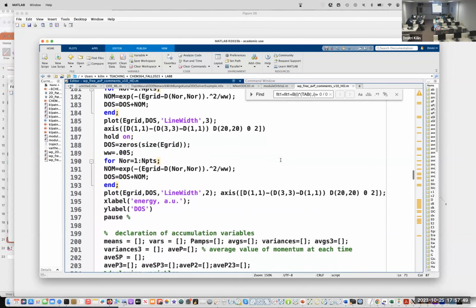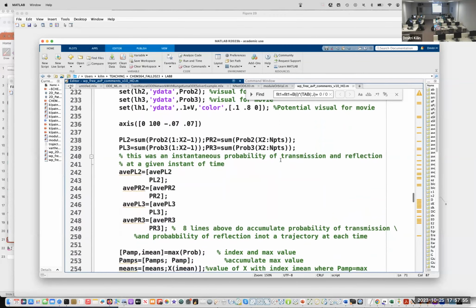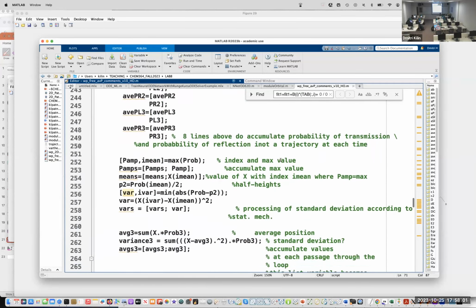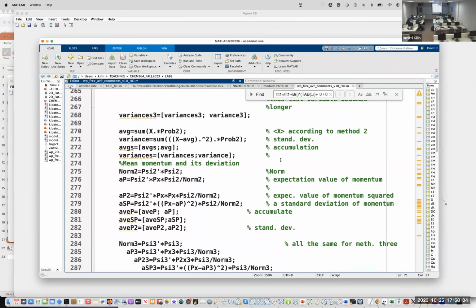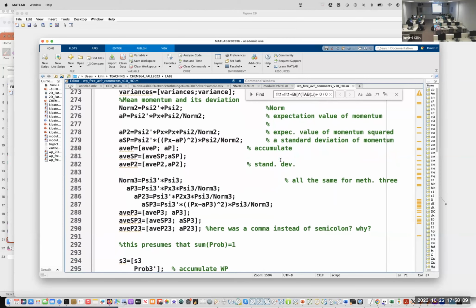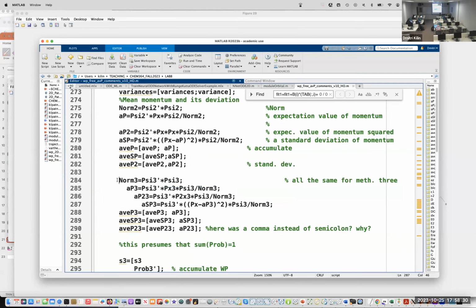And I believe in the middle of the code, there is an additional effort to make sure it gets normalized. So I'm inviting everyone to look onto the lines, in my version 284 to 288.